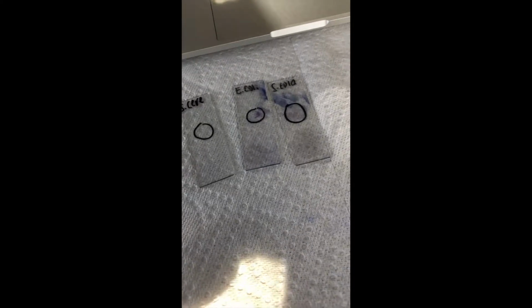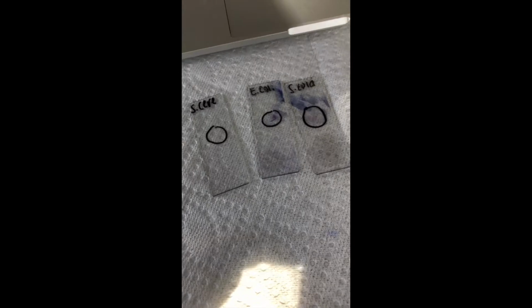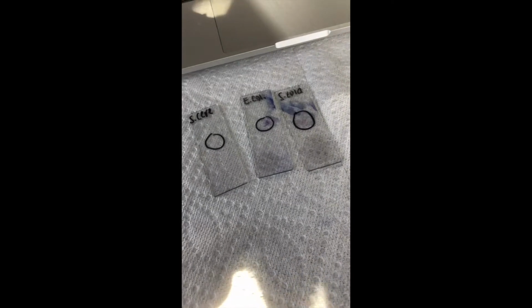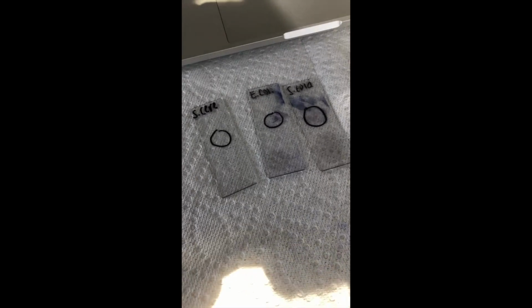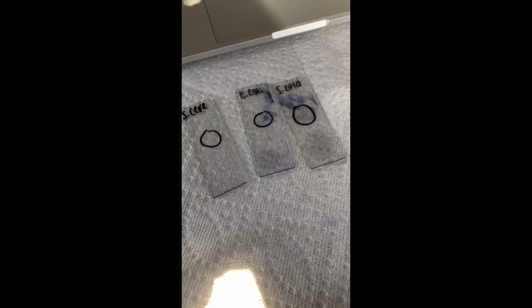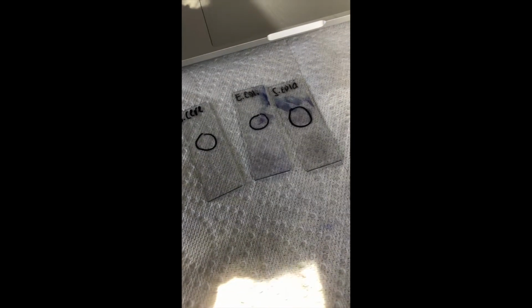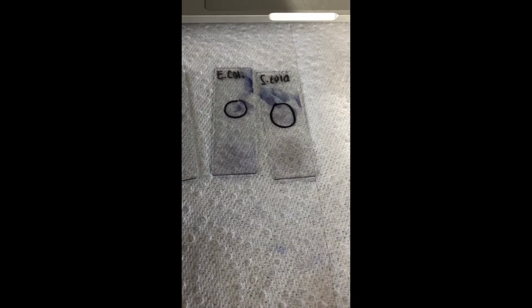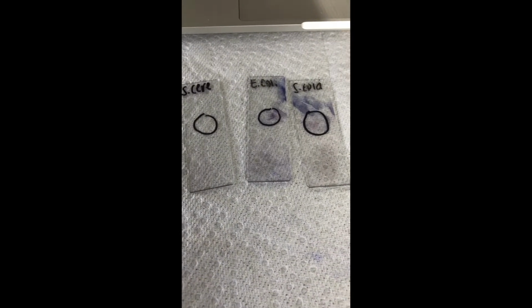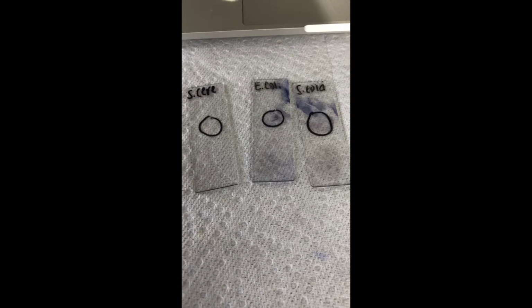The third exercise of this lab was to practice gram staining, in which all 3 of the bacteria first received crystal violet, which sat for 60 seconds and then was rinsed with tap water, and then received iodine, and then was rinsed after 60 seconds, and then received decolorizer, which sat on the samples for 30 seconds, and then after that was rinsed, the safranin was left on each culture for 30 seconds and then rinsed.